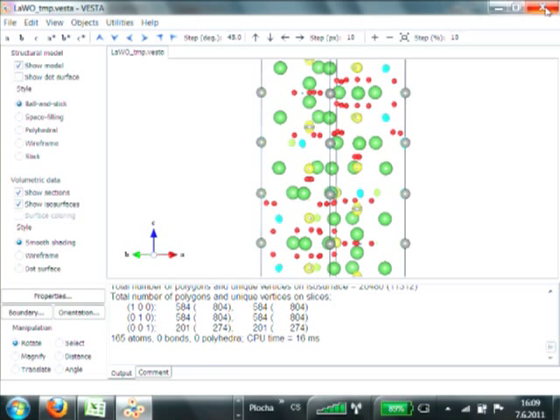You would think that the program would expect to find 9 atoms, but it has no problems at all finding about 100. My question is, does it help if you make use of the volume? If you say every atom should be 20 cubic angstroms, you could easily think there would be about 30 of those, and then it should look for 90. But it seemed it did it itself.